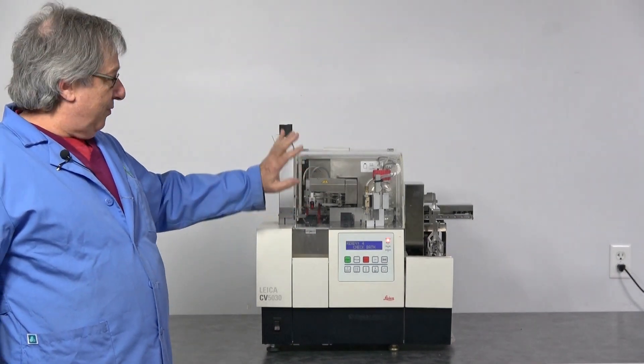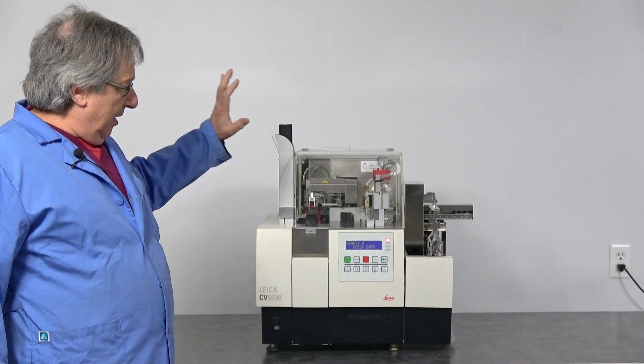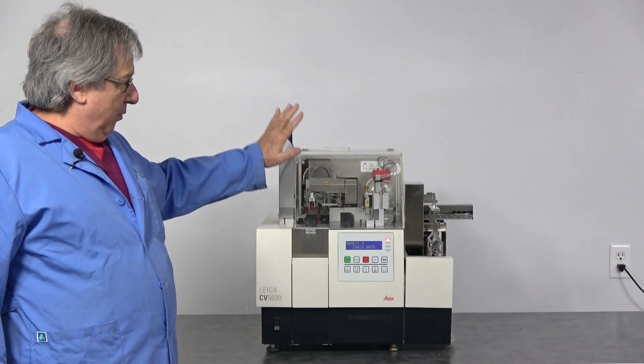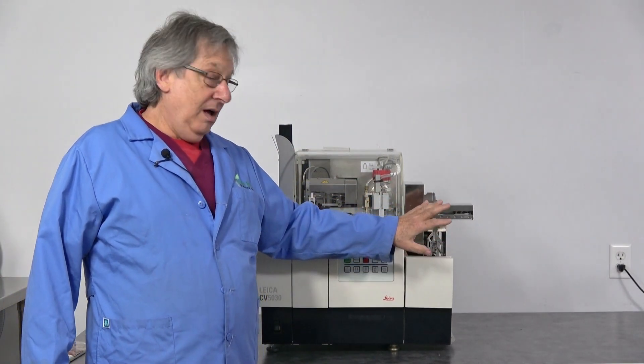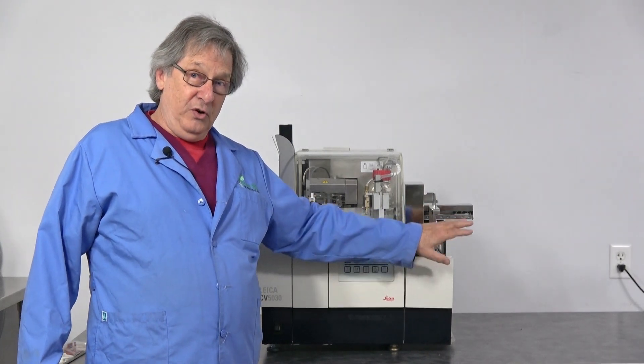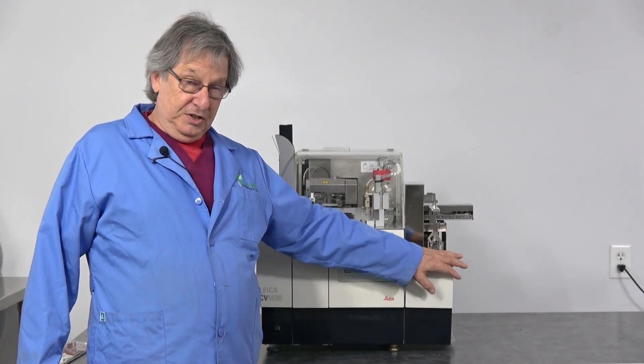We bought a couple of these. These are great units. This particular one has the transfer station so you can hook it up to particular stainers.